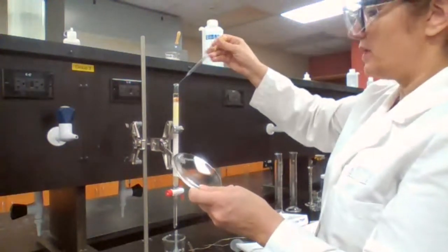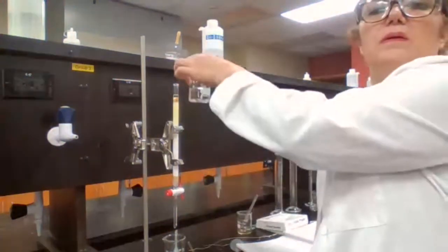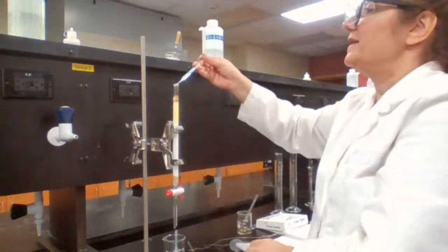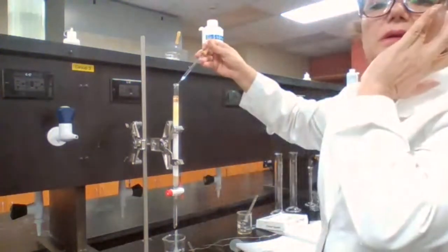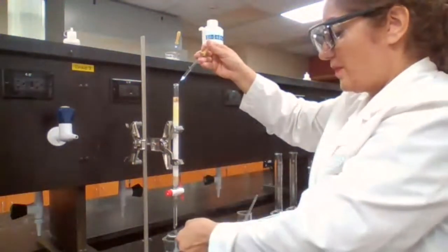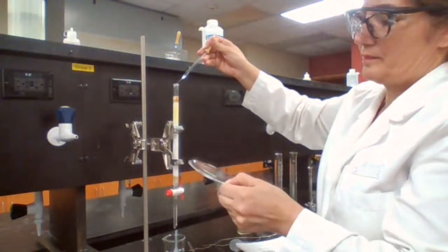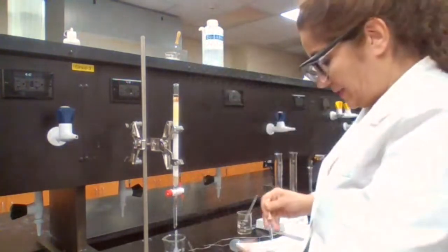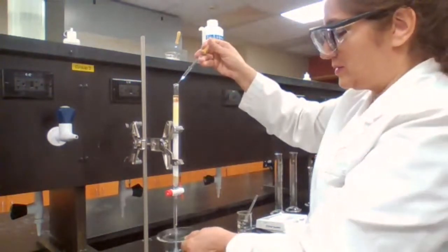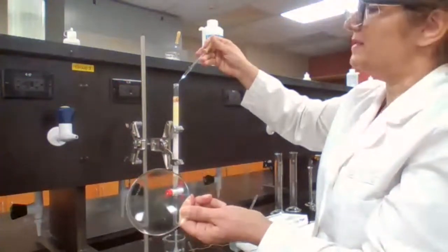Okay, take a screenshot of the column chromatography setup. We're just adding the nonpolar solvent at this point. The compound is already in the column when we applied the solution that I made with the toluene. It was a mix of the two compounds and the toluene. So I'm just adding hexane as the nonpolar solvent now.